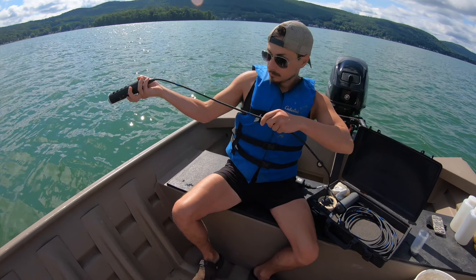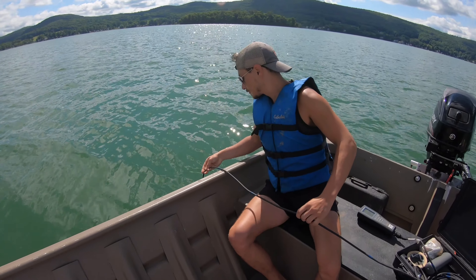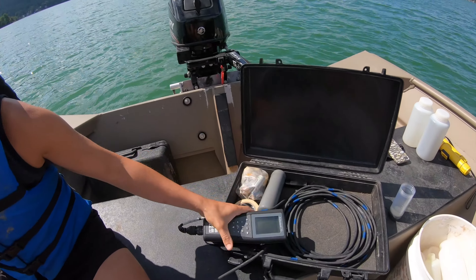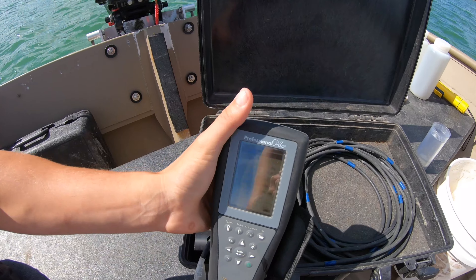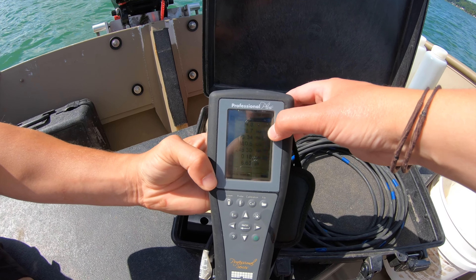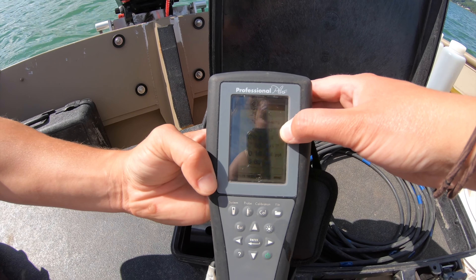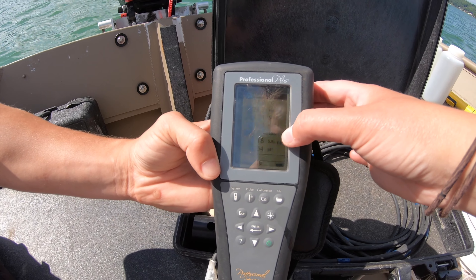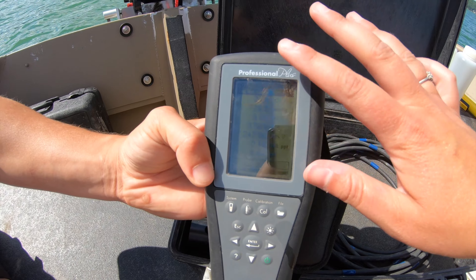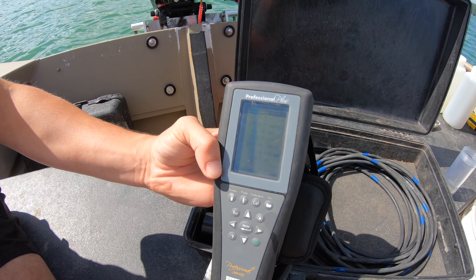We'll send this down. Usually this is a two-person job. Matt's going to let it all regulate for a second. On the screen we have temperature at the top, then barometric pressure — don't have to worry about that too much — dissolved oxygen, conductivity, total dissolved solids, salinity, and pH. We let it level out, then take a notebook and go from the top to the bottom recording readings.